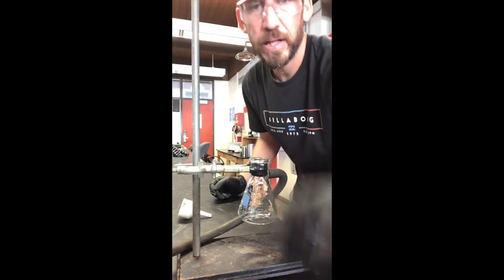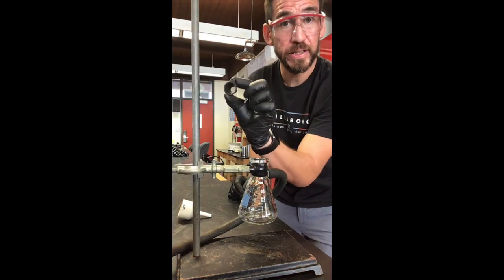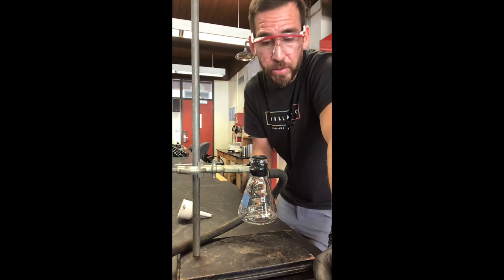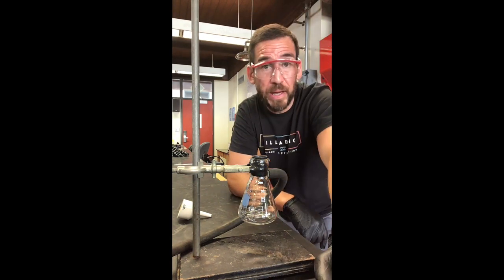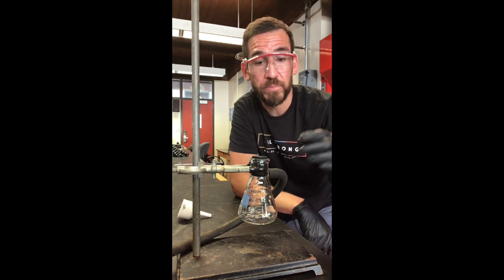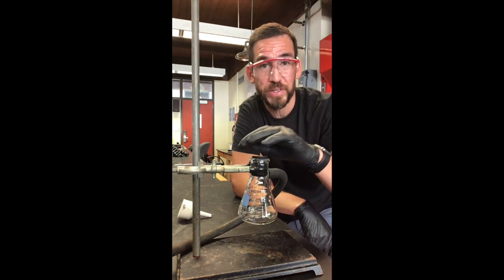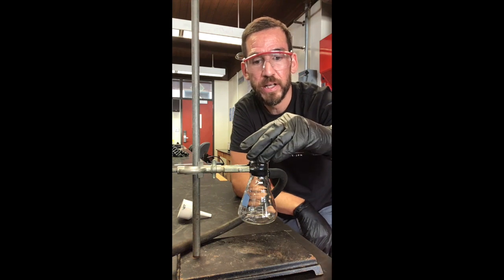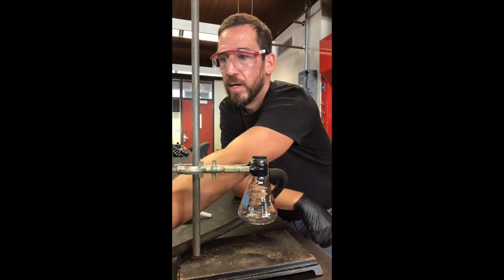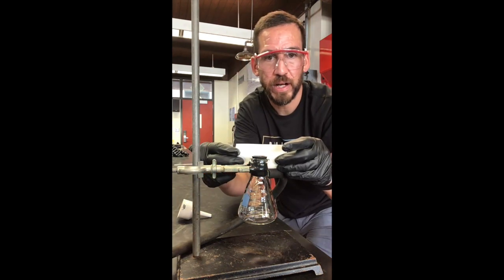Anyway, now we've got this neoprene adapter. This is the smaller one of the two. The way to know which one to use is basically if it falls inside, that's too small, and it's going to be really hard to get out, so be careful when you do that. But this one sits right on top. You can barely see the lip. Kind of chilling right there, yeah?